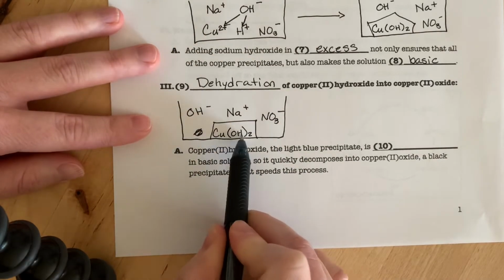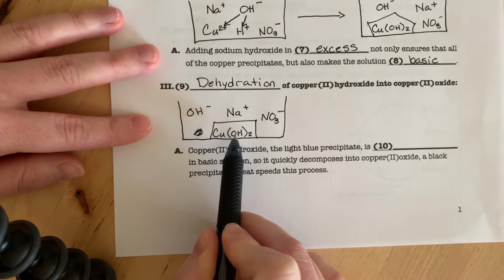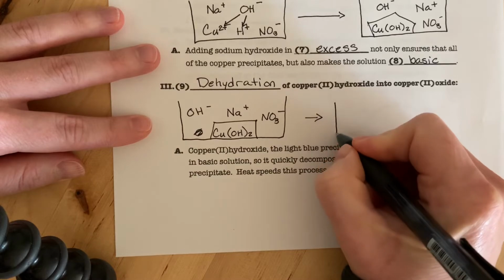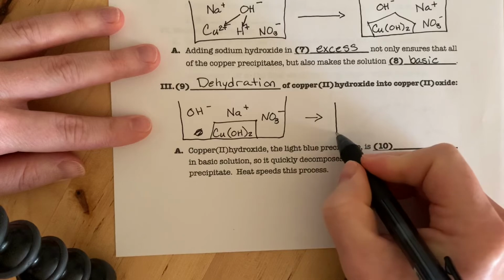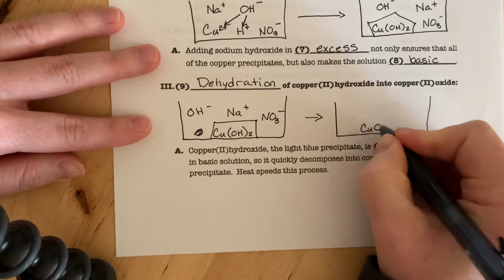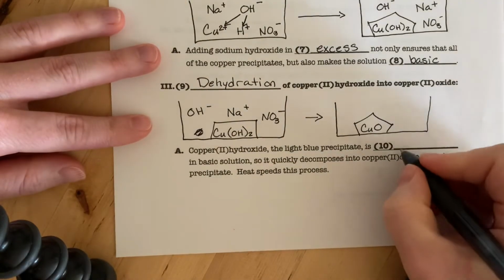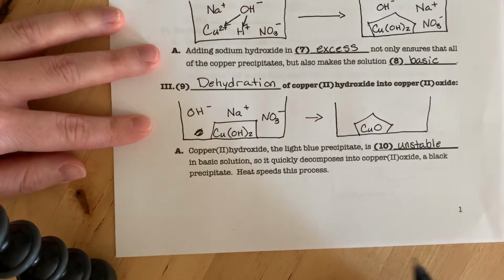Okay, so this copper 2 hydroxide just breaks down. It releases the 2 hydrogens and forms water with the OH ions, leaving our solid just as copper 2 oxide, which is a black solid. We can do this because the copper 2 hydroxide is really unstable, or it's unstable in basic solution.